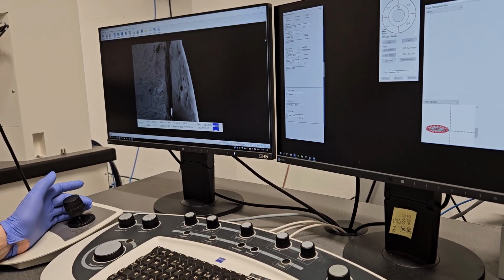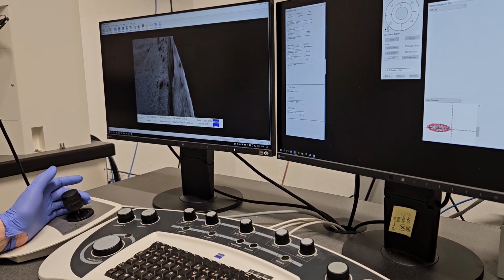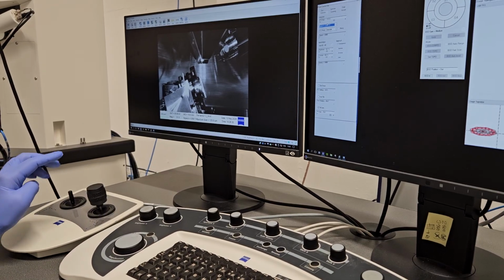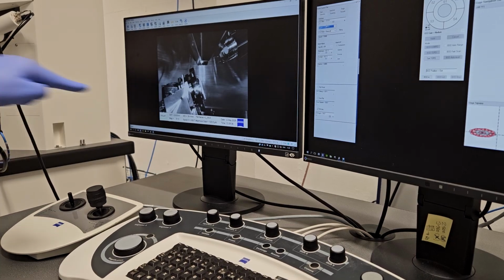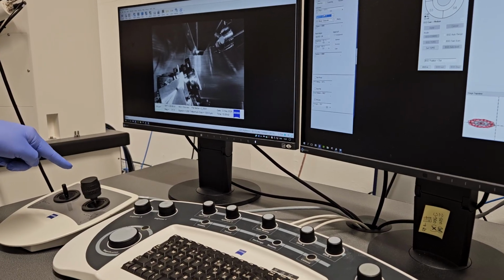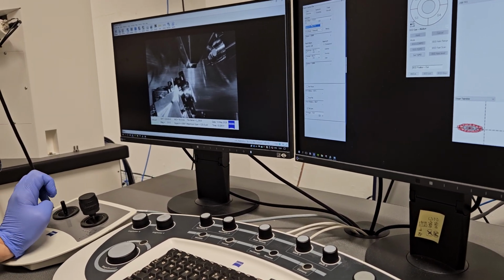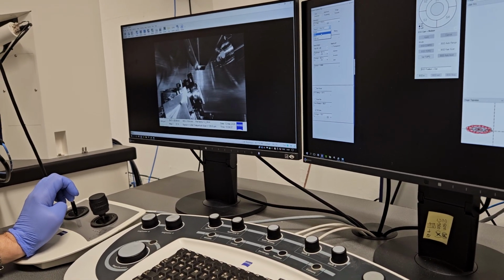Nothing. Now we're going to the dangerous thing. This is up and down. This is down, yes? What I previously said is that when you move along this side, basically along this direction, it's not dangerous. You're not going to hit anything. That's X? Yeah, that's X. It's X here, but on the screen you see it in this direction. But if you're moving up and down, Y, then it might be dangerous. So if you're moving Y, then yes. Okay.